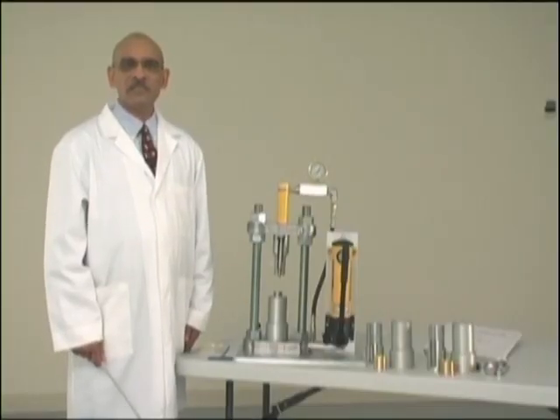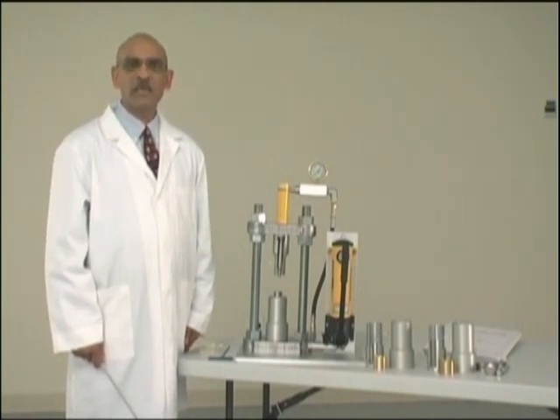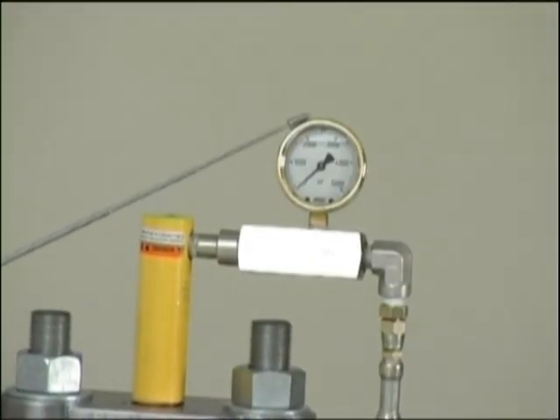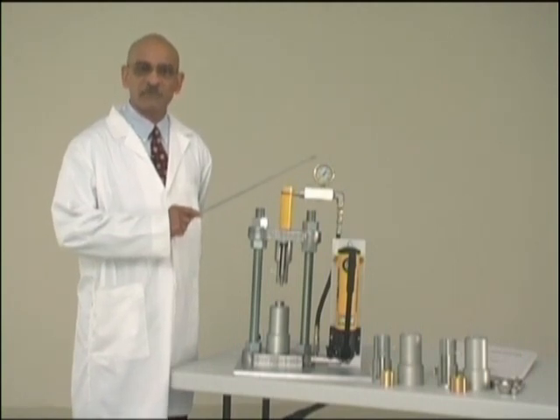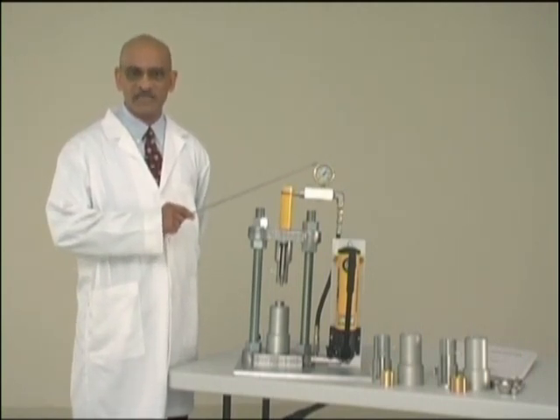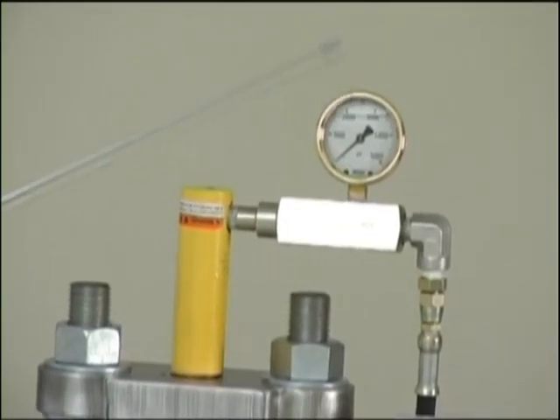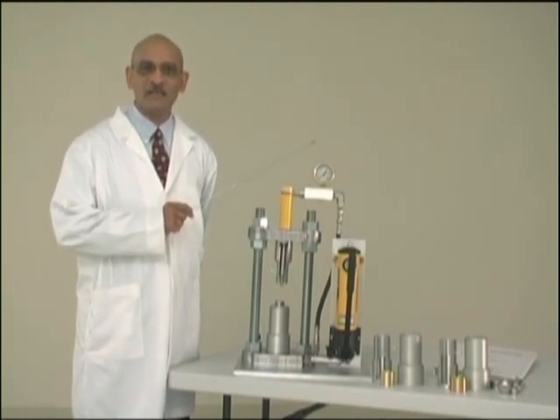The compression is accomplished by means of applying hydraulic pressure using a manual hydraulic pump. A gauge is provided to monitor the pressure used to compact the powders. This gauge can be provided in three different capacities: 3,000 pounds, 5,000 pounds, or 10,000 pounds.